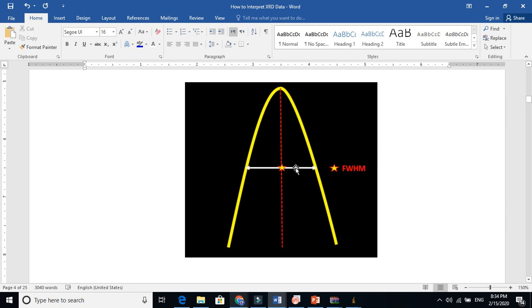If this peak is 100 meters high, we will cut this at 50 meters. Just for simplicity. If it is 100 centimeters high, we will cut into 50 centimeters. And we need to measure this white arrow. This is called full width at half maxima, because it is at half maxima, half means 50, and this is the full width.